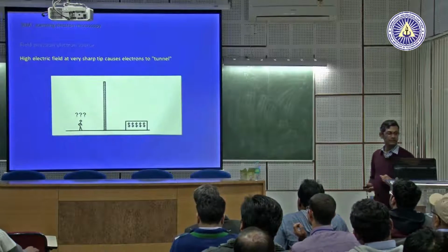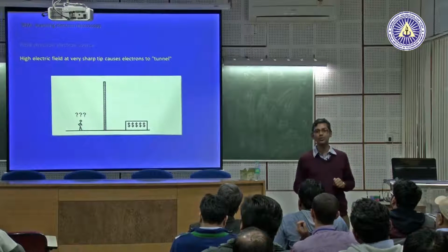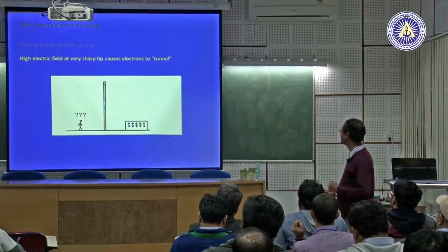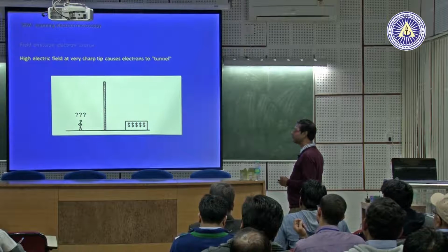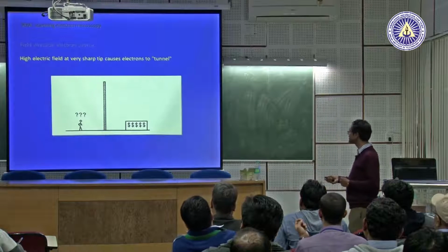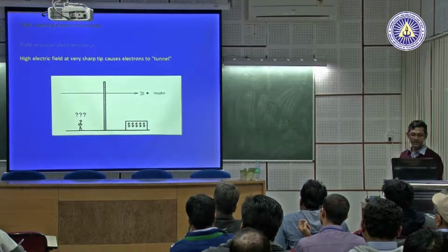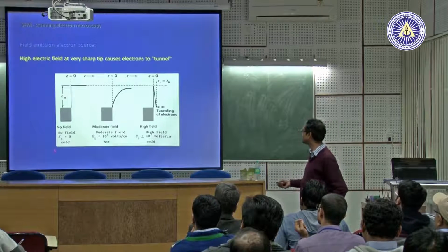We can actually make the electron tunnel through, right? You can make the electron tunnel through a barrier. This is by quantum mechanical definition. Think of a person facing a barrier, he doesn't know how to go through. So you can make it transparent and he will tunnel through. How is this done? This is the way it is done. Don't try to read this, just follow along.